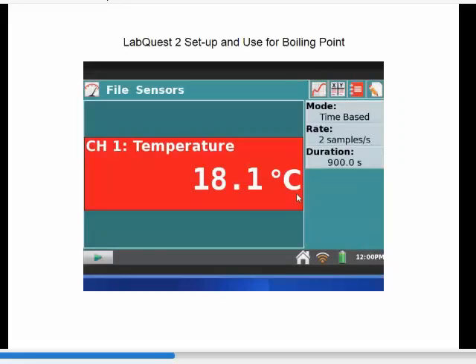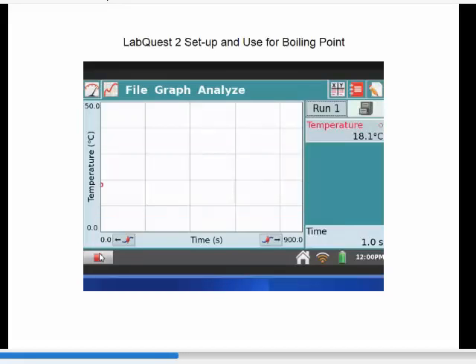So now these data, when they run, will actually run for 900 seconds. If I start my run here, out here is my 900 seconds in the lower right part. If your run stops, if you run out of time, you're still heating up, what you do is you don't panic. This red box will turn back to green arrow when the run's done. Just click on the green arrow again, and when it asks you to append these data, that way you'll still keep taking data. We don't really care about the time here. The only thing we care about is what's the highest temperature we get to and stay at.